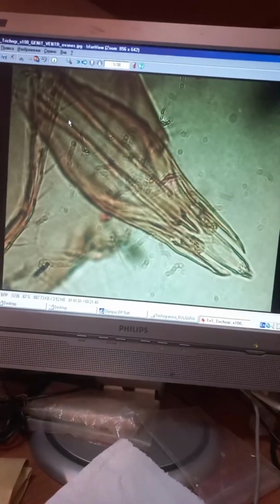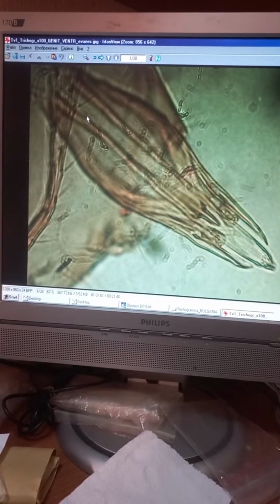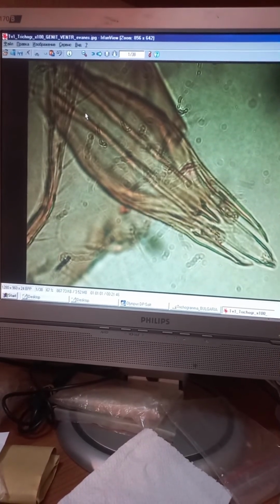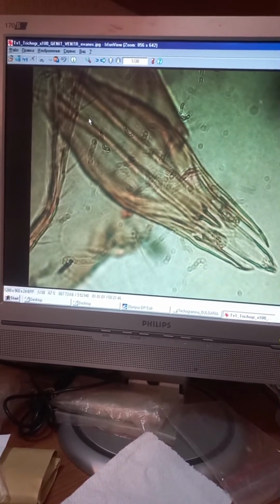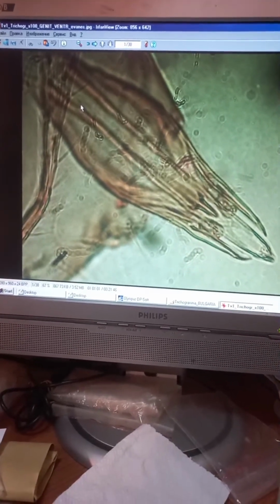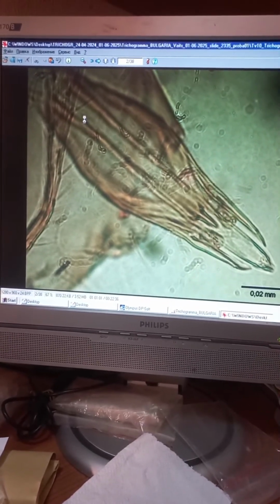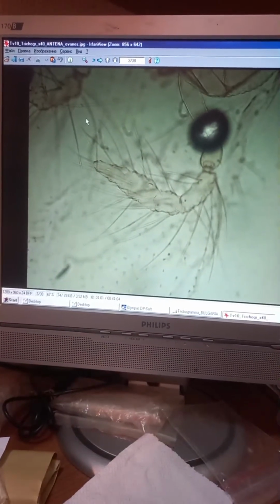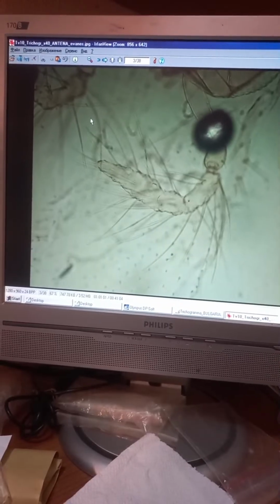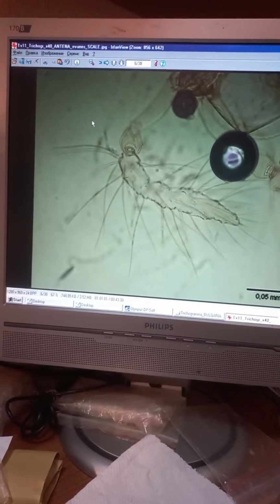Now I show you Trichogramma evanescens. Here, white shape male genitalia and very narrow, like angle, intervolsellar process or ventral process of phallobase. So I change focus. This is antenna of evanescens, 400 magnification. Sorry for some bubbles. It happens.